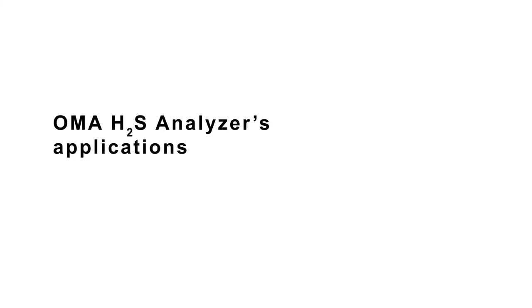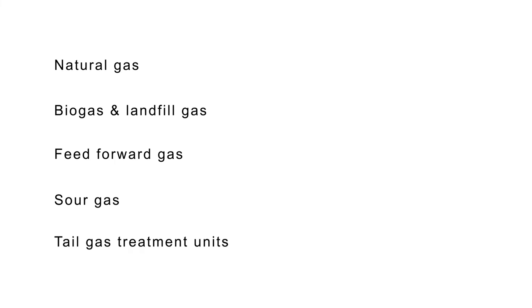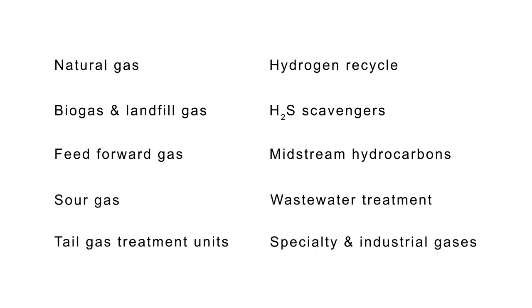The OMA analyzer can be utilized in the following applications: natural gas, biogas and landfill gas, acid gas or feed-forward gas, sour gas, tail gas, hydrogen recycle gas, H2S scavengers, midstream hydrocarbons, wastewater treatment, and specialty and industrial gases.